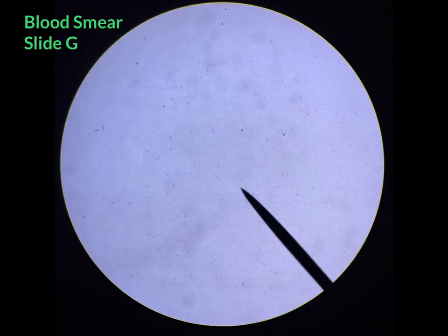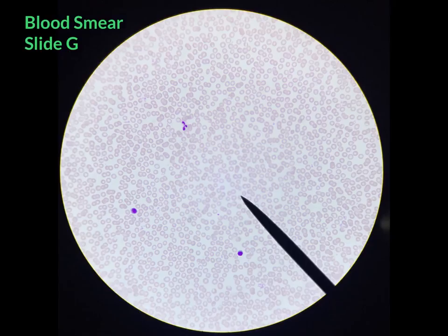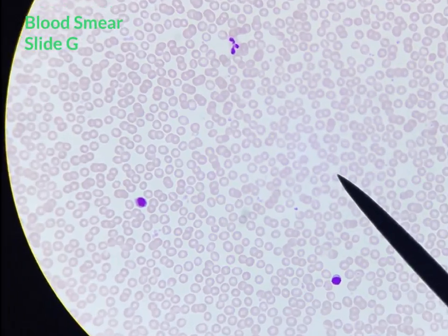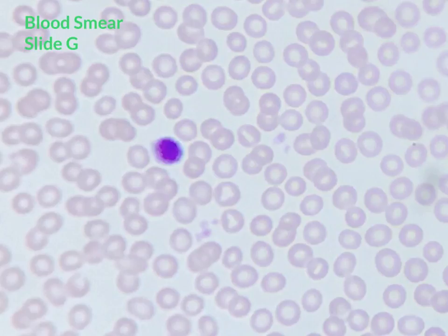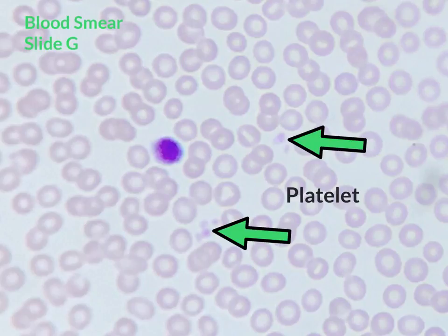You can identify the cells of blood from the blood smear on slide G. When looking at blood under high power, scan the blood smear and find a representative sample so that you can see the three types of blood cells. The first blood cell is the platelet, which looks like tiny fragmented pieces, and its function is to help control bleeding.